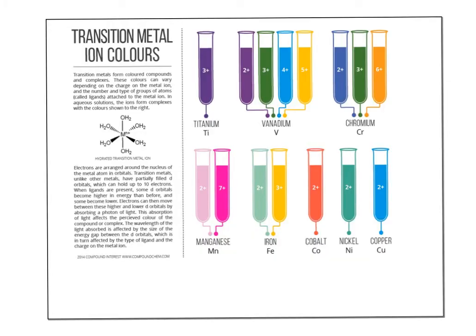All right, you do not need to memorize what colors each ion or element are, but it is useful to know maybe what things are colored. So usually, just as a rule of thumb, spectator ions are not colored, like potassium or chlorine or nitrate. It's usually going to be those things that could be insoluble, but I would say it is good to have a rough idea, so you're kind of familiar. Again, you don't need to memorize, but you should have a rough idea of what things might turn color in solution, because clear things will not work with Beer's law.